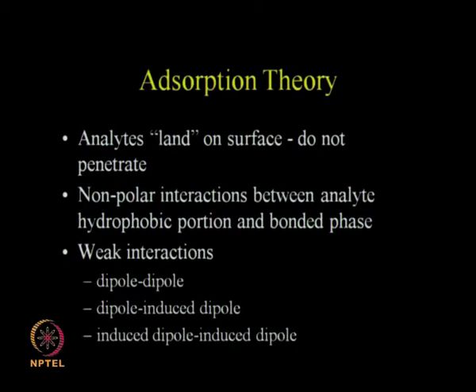The third theory is the adsorption theory. What happens is that the analyte lands on the surface of the stationary phase, so it does not penetrate through. There are a lot of non-polar interactions, that means hydrophobic interaction between the analyte's hydrophobic portion and the bonded phase.